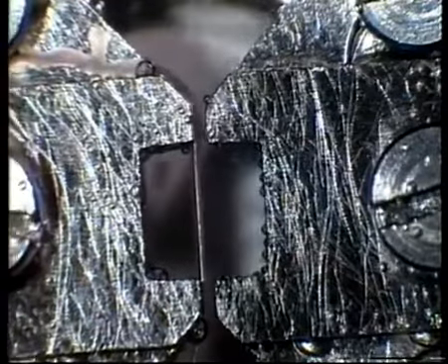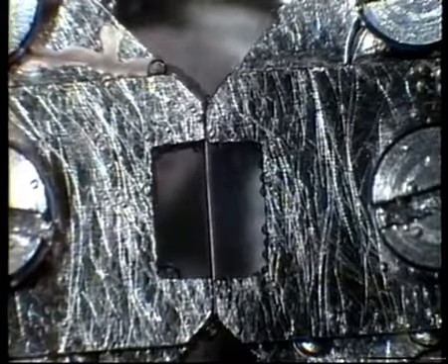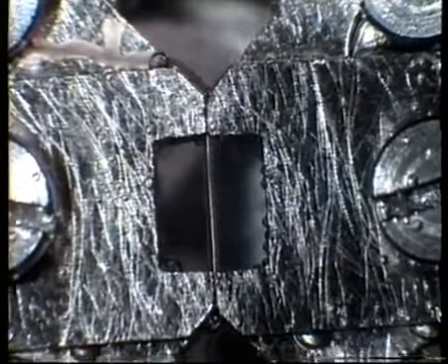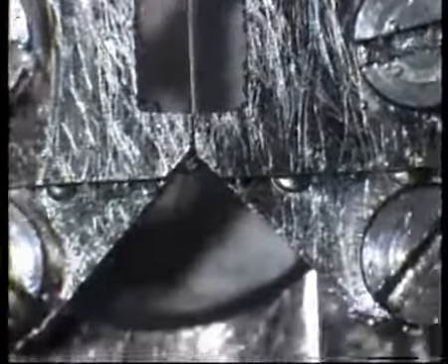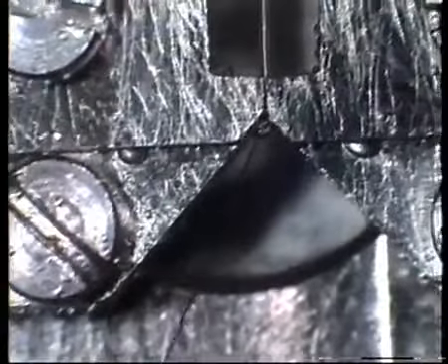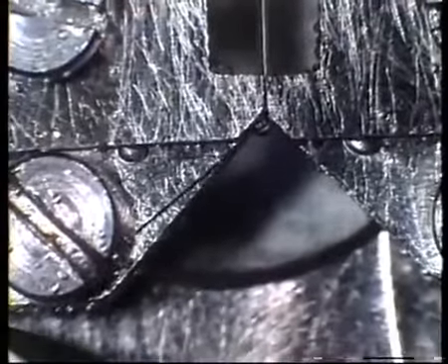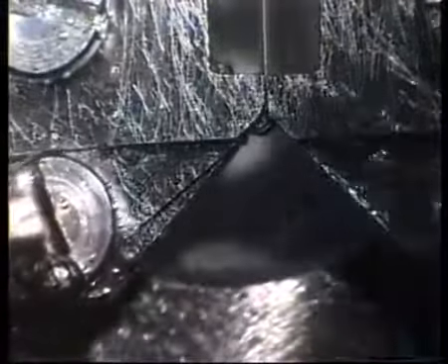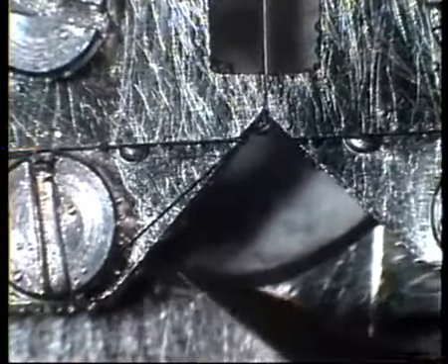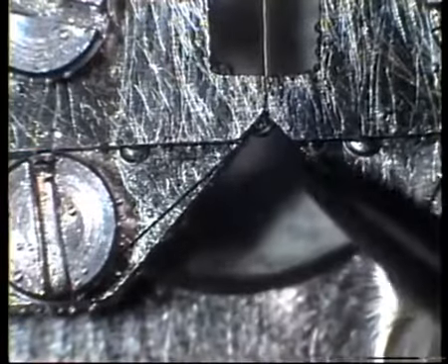The heads are moved together to clamp the wire. Then the wire is tightened with a pull, bent to the lower left screw and fixed in place. It is important that the wire is tight and follows the support all the way. Notice that the screws are turned in clockwise, so to tighten the wires, when tightening the screws, you always place the wire clockwise around the screw head.